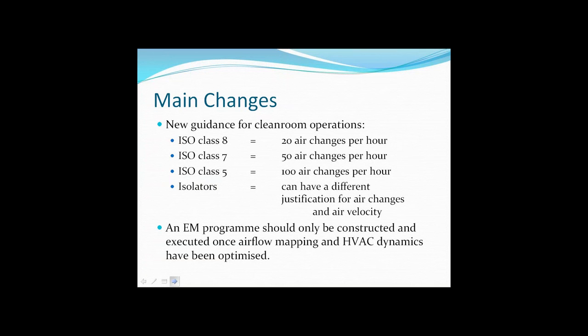The USP chapter also discusses airflow visualization, or the smoke study, and says that these are required at ISO class 5. And the chapter very usefully says that an environmental monitoring program should only be devised once airflow mapping in the operational state has been completed, and then from that any HEPA filter or HVAC system issues have been sorted out.